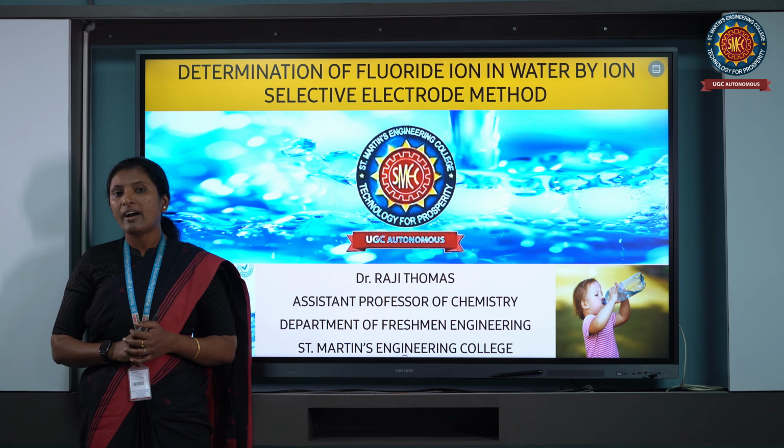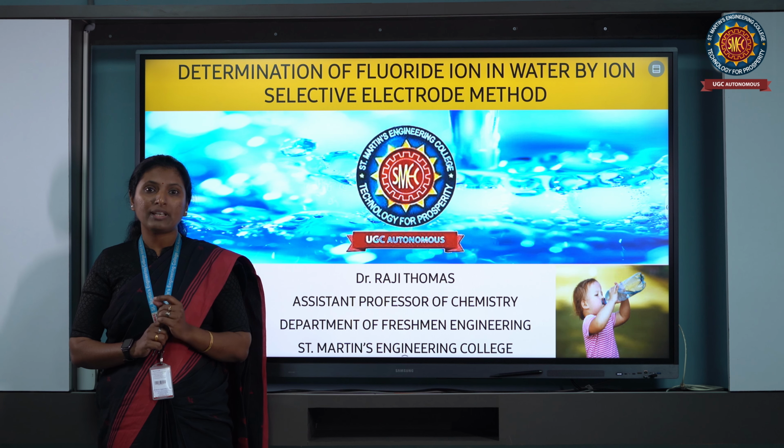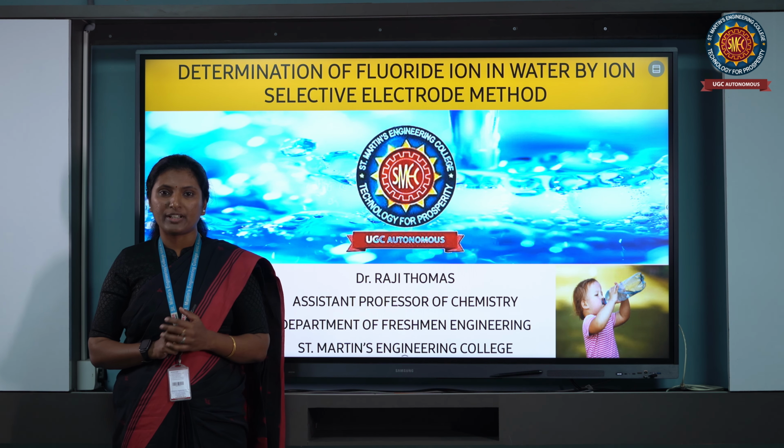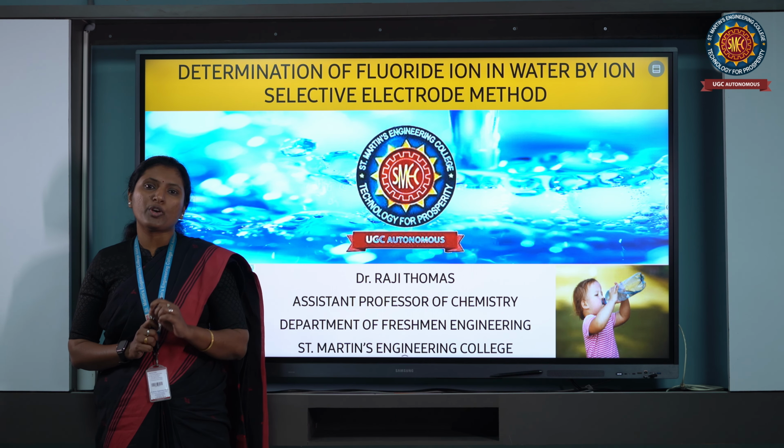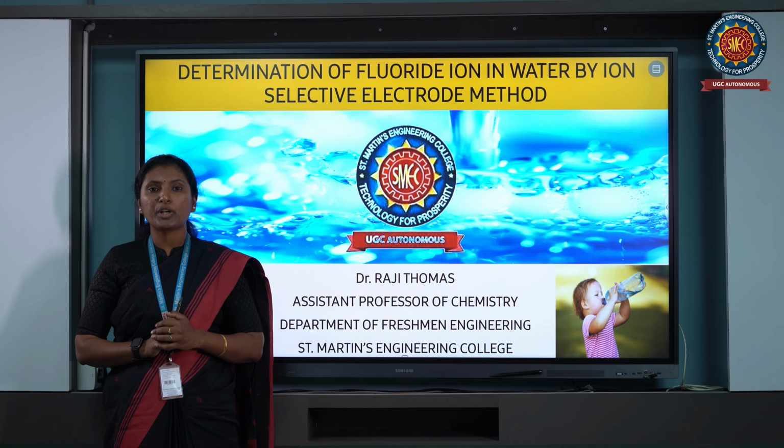Just imagine I am giving a glass of water to you. First, what will you observe? What is the color of that water? It is a minimum requirement of drinking water that it should be colorless.